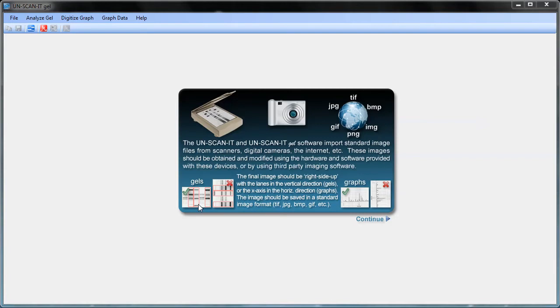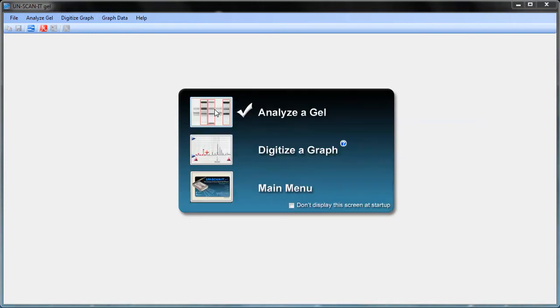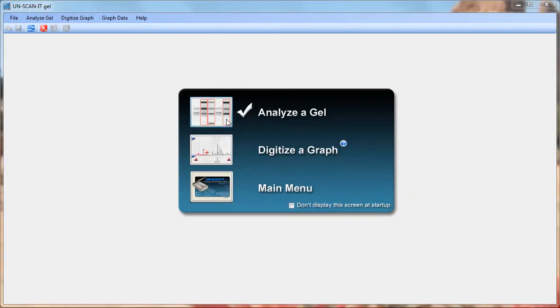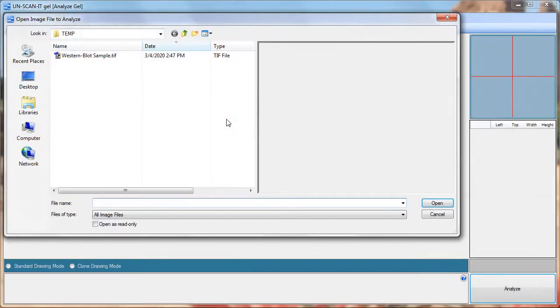The image to be analyzed should have the lanes or bands migrating in the vertical direction on the image. For this tutorial we will choose a sample TIFF image file.